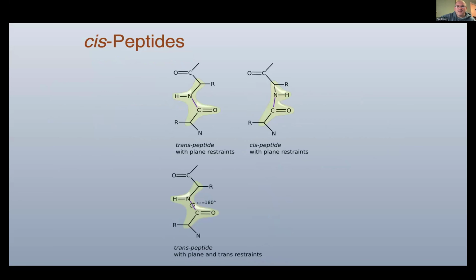The idea was that you could drag the atoms around in real space refinement and push the nitrogen around so that it was on the same side of a peptide bond, between two C alphas, as the CO. If you then applied planar restraints on that, you'd squish it into the cis conformation. Coot warned you, and it was my view that if you didn't know what a cis peptide was, you had no business pressing the OK button. But apparently some people did, and there was an issue of cis peptides.